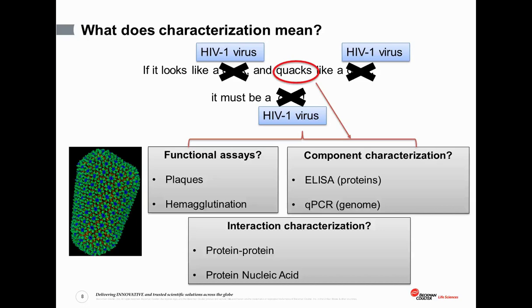So this, of course, is the crux of the question. What does it really mean to characterize a virus? Now, if you are characterizing a virus, one of the things which you might be doing is looking at functional assays. In other words, is the virus infecting the organism that it's supposed to be infecting? And you do that by functional assays like plaque counting and so on and so forth.